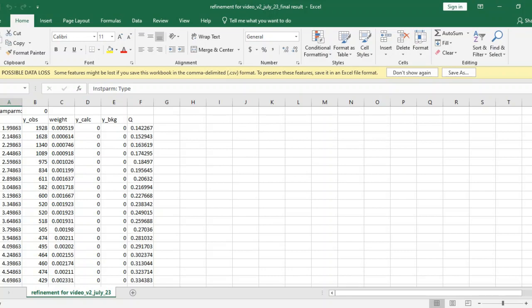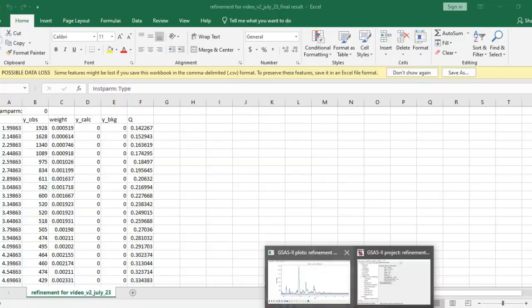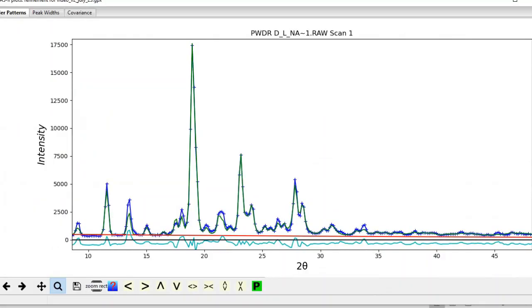We can set a difference pattern as well by setting up, here on Excel, that's open on my screen, a function that is the subtraction between the observed minus the calculated. That's going to give us the difference pattern as well. So we can go to any program you want, like Excel, Orange, and plot this data, and then generate a plot similar to the one we see here on the screen, okay? So make them suitable to have a publishable quality figure.